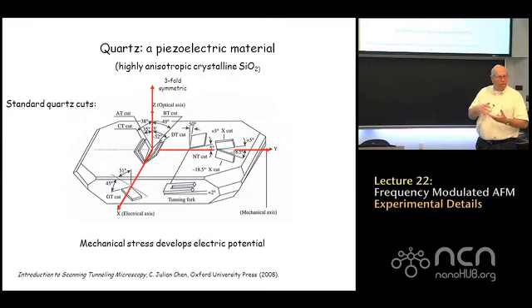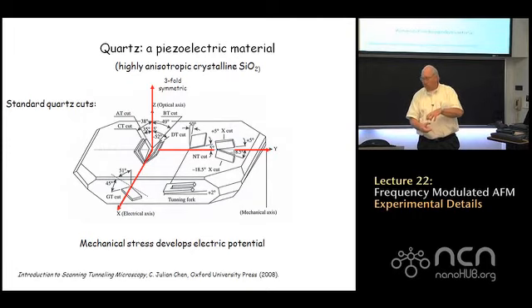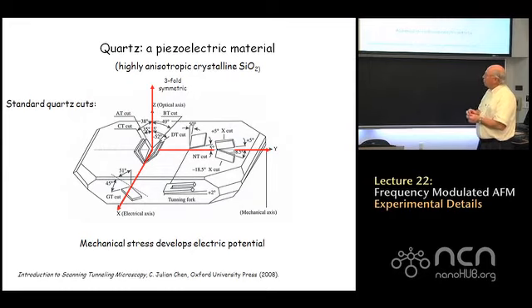The phenomenon was actually discovered in the 1880s in France. They just noticed that if they took a quartz crystal and placed weights on the crystal, a voltage would develop across the faces of the quartz. That was the first observation of piezoelectricity.